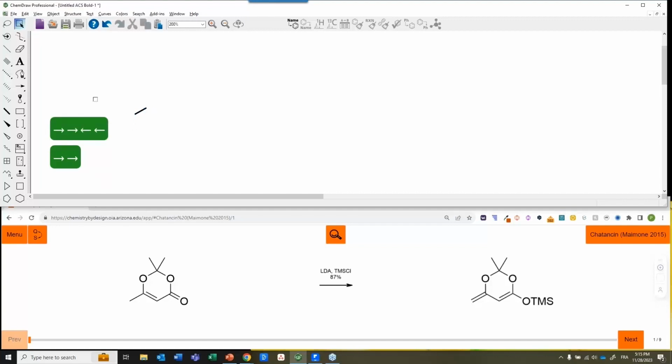So the basic principle is you insert a bond, and then you take a selection tool, like the rectangle tool, the marquee tool. Once you have inserted a bond and you have a selection tool, you can touch a molecule, not clicking on it, but just touching the molecule. You're going to activate the hotspot on that molecule. So that's just a CC bond. And then the hotspot can be moved with the arrows on your keyboard. And then start simple.